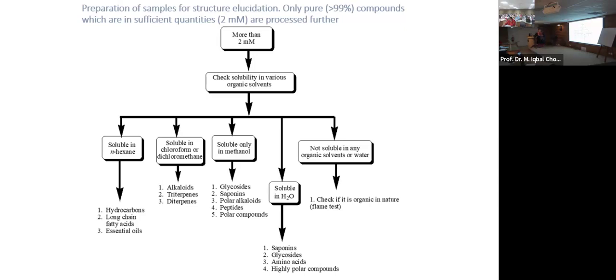That's why solubility is extremely important. If you have a pure compound, you need to check if it is soluble in the commonly used deuterated solvents. Many other uncommon deuterated solvents are also available, but they are not available in the facility. If you want to use one, you may ask your supervisor to purchase the deuterated solvent for you.